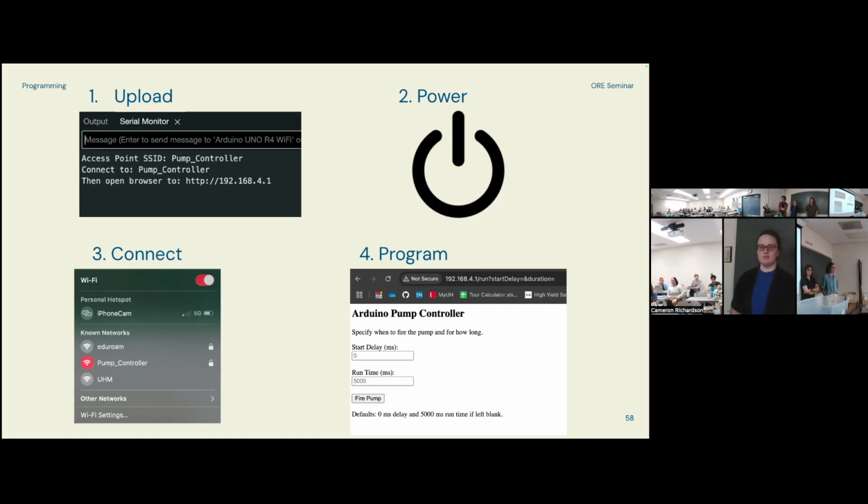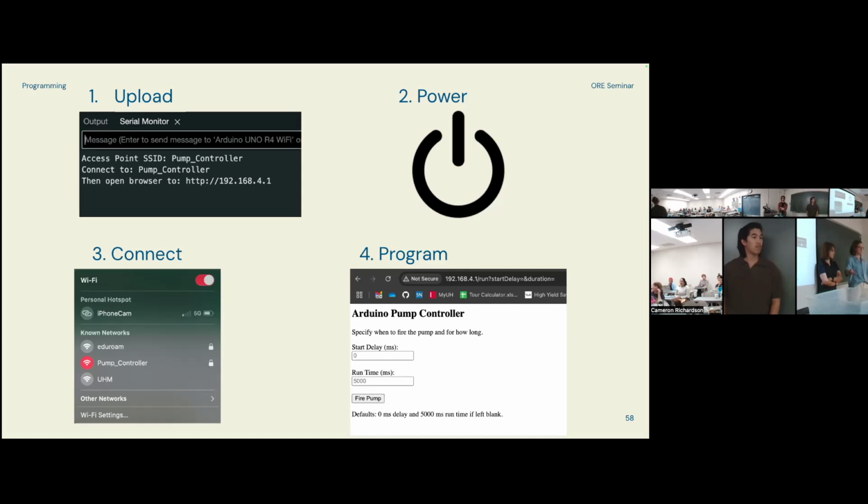Maybe a dumber question, just because maybe I missed that part. You have one sample bag attached, and say you want to take a new sample. Are you going to drain it, or are you going to have multiple bags? To get multiple samples, the way our sampler is set up, you would add another sampling unit to it.